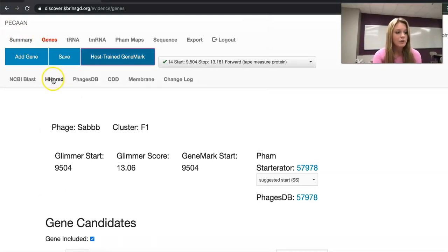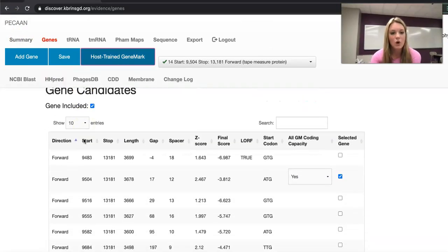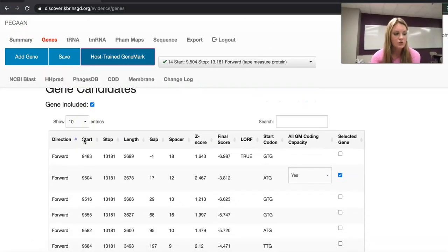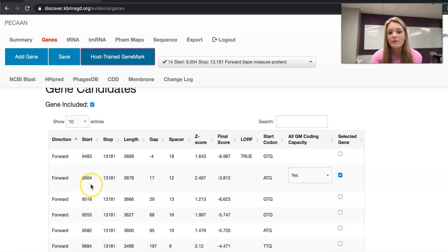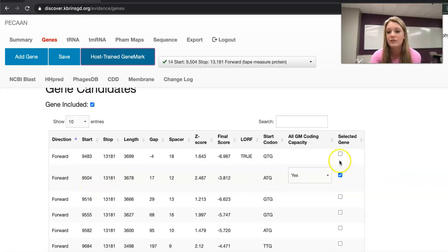As you scroll down you can see the list of all the different potential start calls with all their information. Since 9504 base pairs was a start called by both Glimmer and GeneMark we have selected this gene.